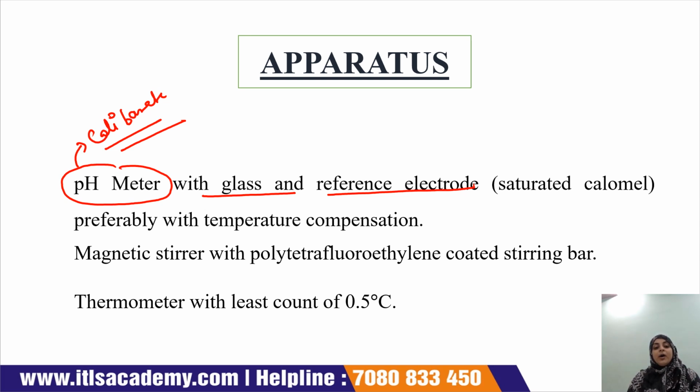Now we require a pH meter along with a glass electrode and a reference electrode, and what is this reference electrode?